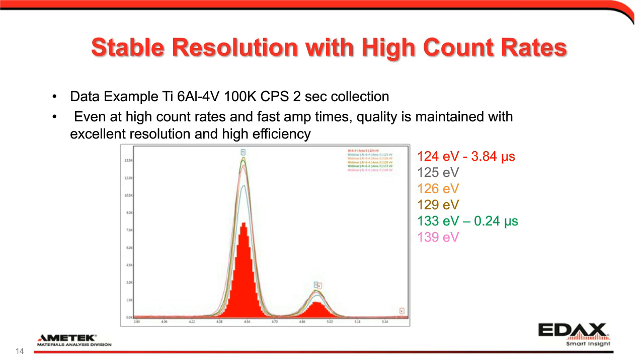And all of these peaks with the overlap certainly tax the pulse processor and the software routine.